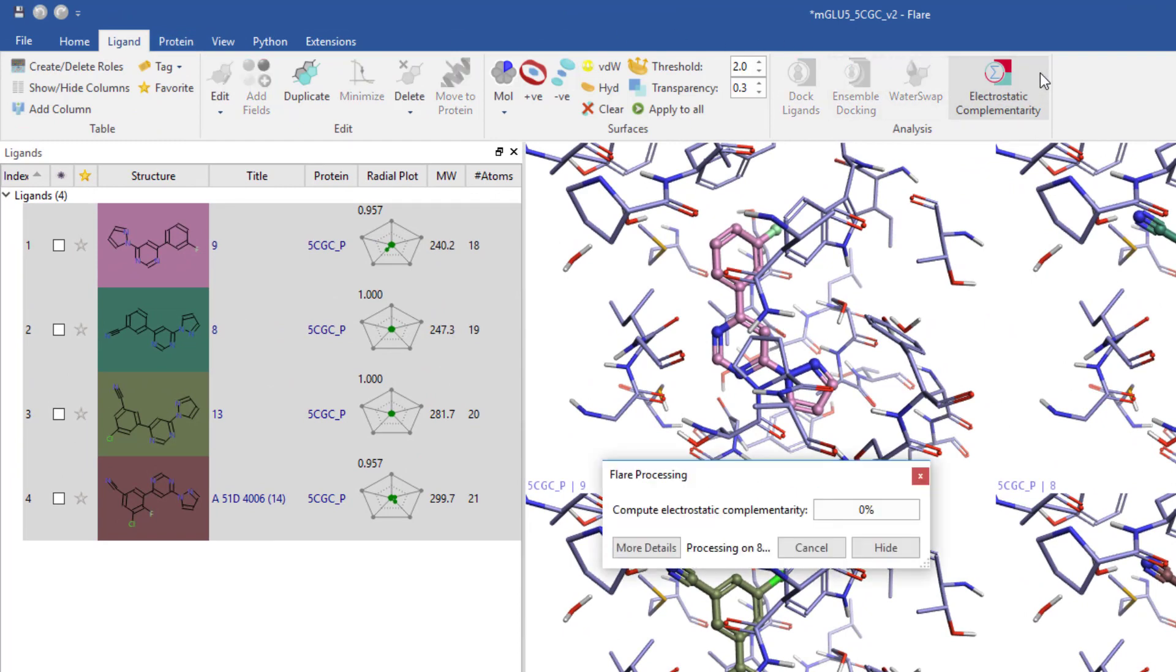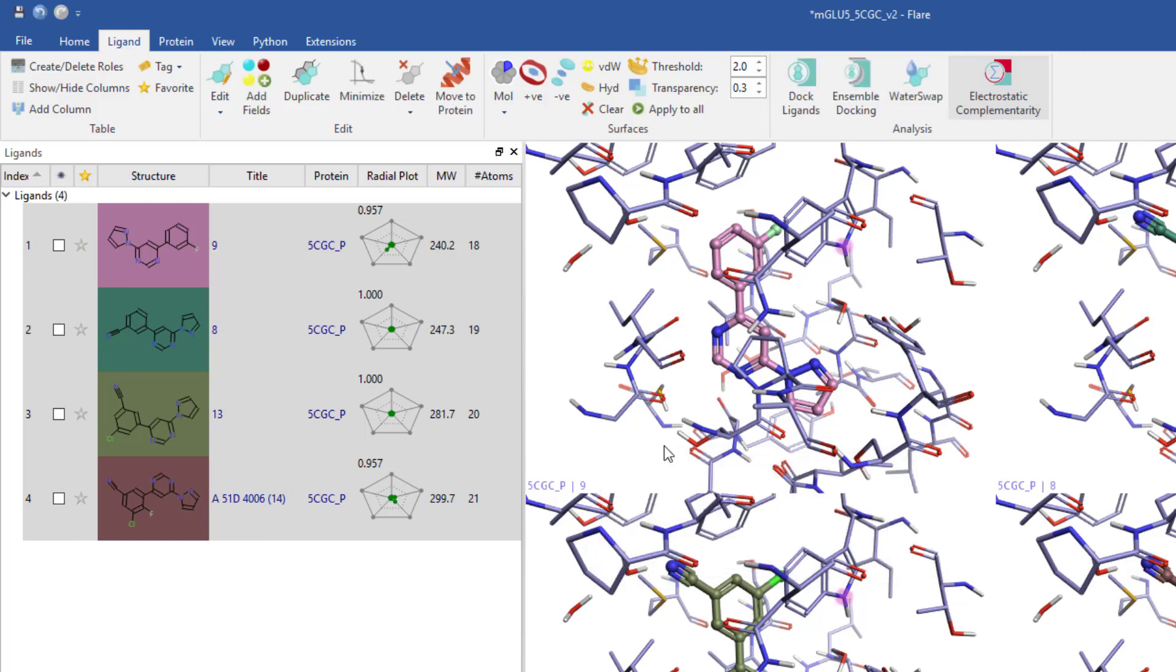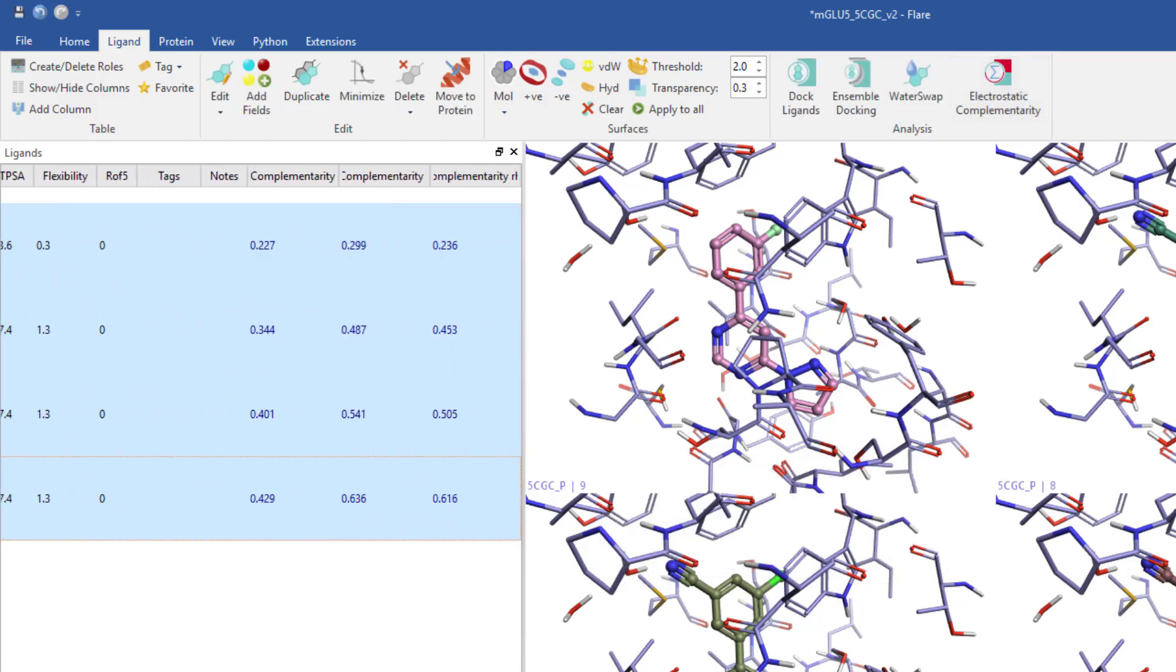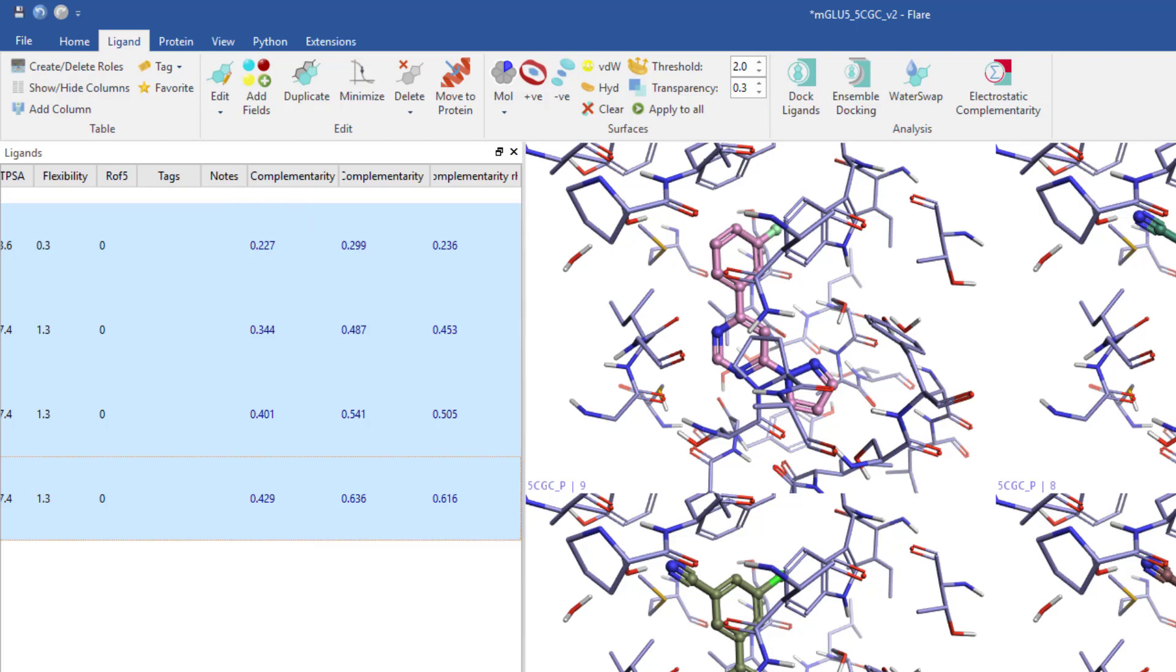Three different values are calculated and reported in the ligands table, ranging from 1 (perfect complementarity) to minus 1 (perfect clash). Each takes different characteristics into account, allowing you to pick the value that best suits your protein.